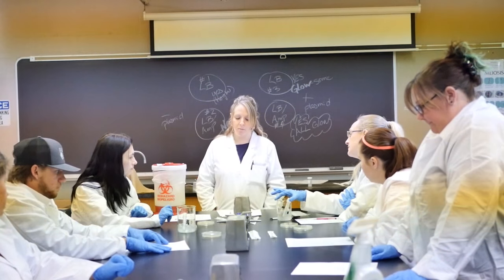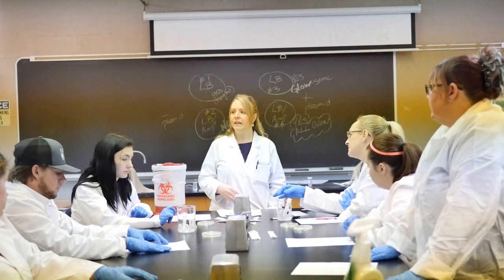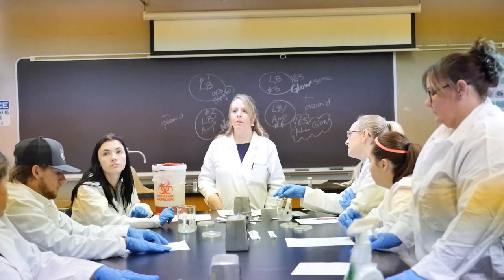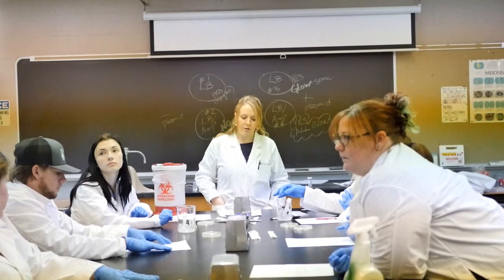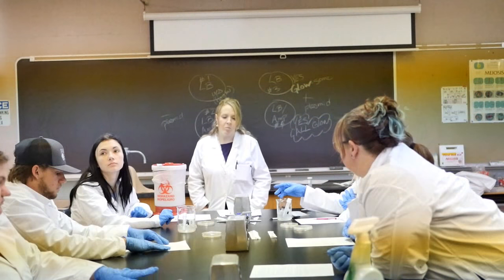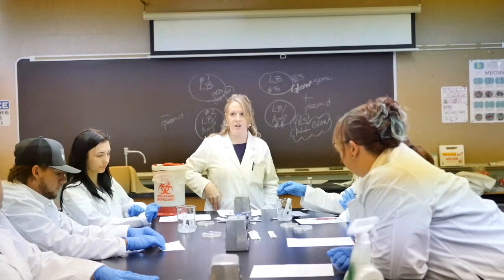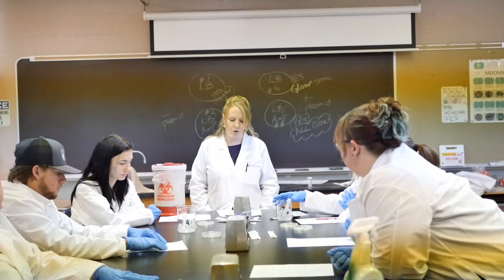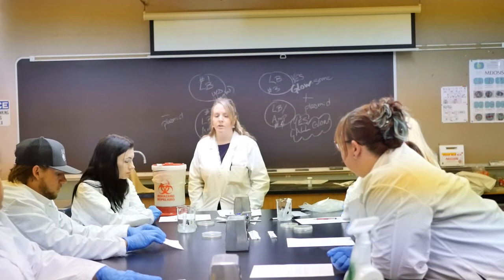This is going to be performed for exactly 90 seconds, so one person needs to keep their eye on the clock. When they say go, make sure that you stick your tube into the hot water bath, agitate it around for a little bit. Every so often you want to keep it mixed in that process, and then as soon as 90 seconds is up, it goes directly back into the ice bath for recovery. That is going to be a 2-minute recovery. So I'll let you guys get set up to do that.